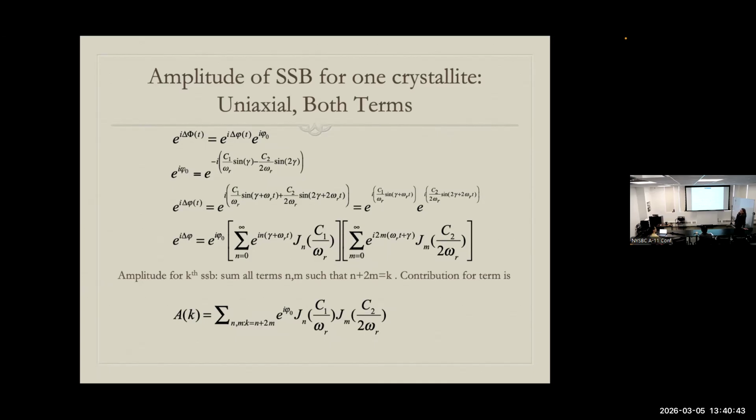We have blind spots. Some crystallites work better than others, and when you're troubleshooting, you may forget that. We also have opportunities to distinguish one orientation from another. If the question is either structural or dynamic, that can be very interesting. Many of those opportunities are unrealized right now, but I think they're very close. So it's good to have that explicitly reminded.